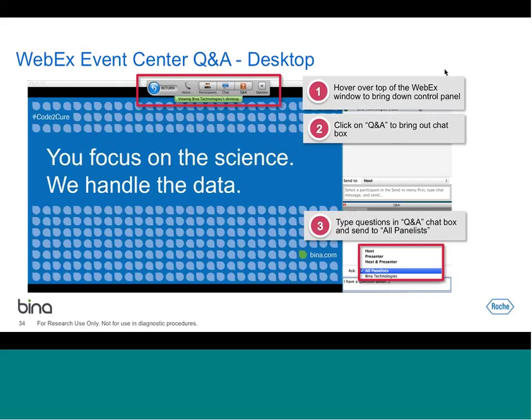The false negative rate really depends on how many mutations all callers have missed. I remember for Dream Challenge stage 3, out of the whole genome, there were about maybe 100 mutations missed. So that's why we don't have 100% sensitivity; it's 90-something percent.